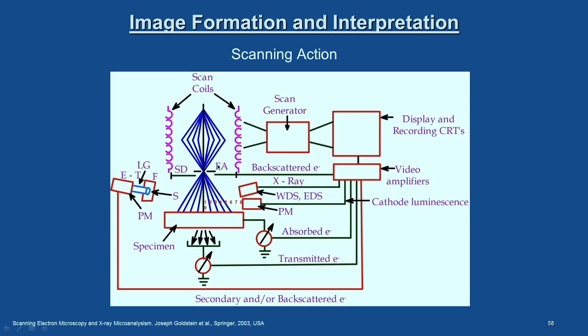And of course, we know that this is limited by the final aperture here, and then it is made to fall on the sample in this fashion.